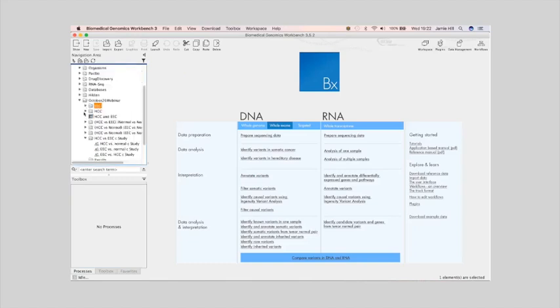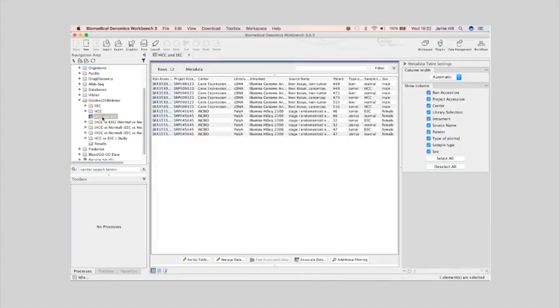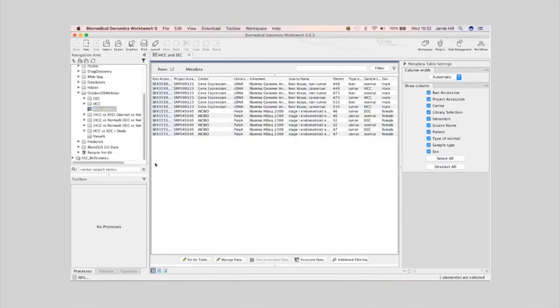So far, we've caught up with where I was in the presentation. Now I'm going to go a little bit further forward before I switch back to the presentation. And where I'm going to go forward to is that just like I set up this metadata table before, where I said tumor, normal, and told it about some reads, I've already done this for all of the samples that I'm going to be using, all 12 samples, 6 from one study, 6 from the other, that we're going to be using in the downstream analysis.